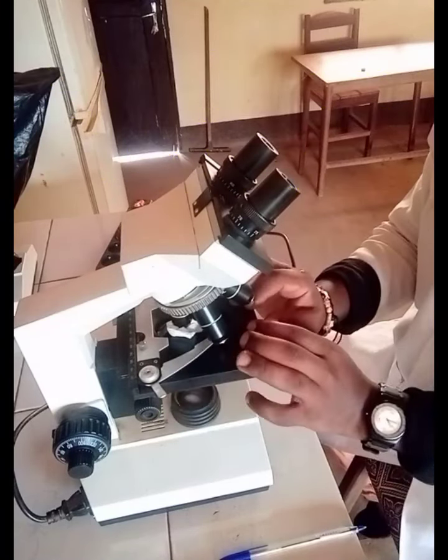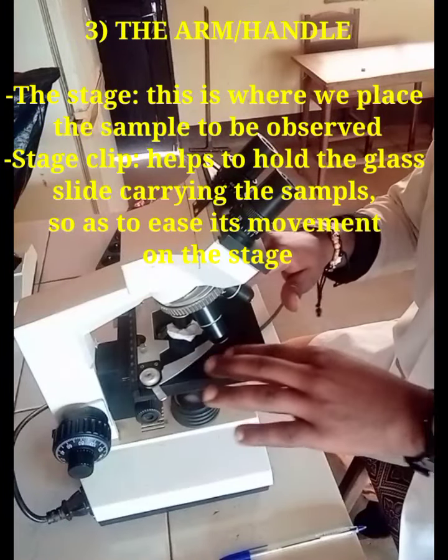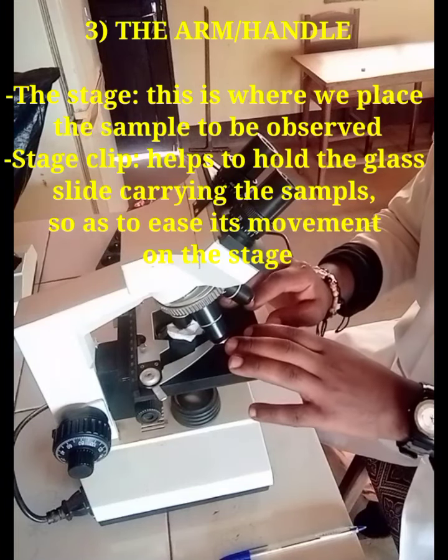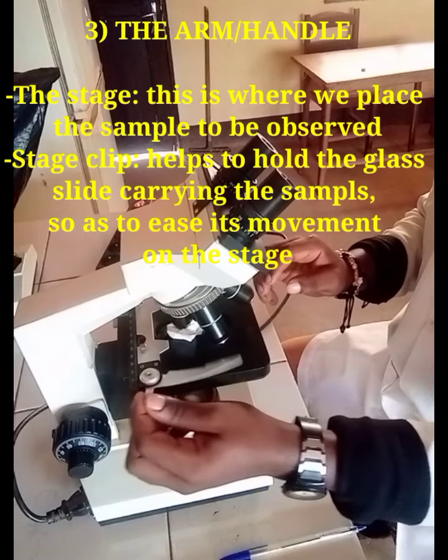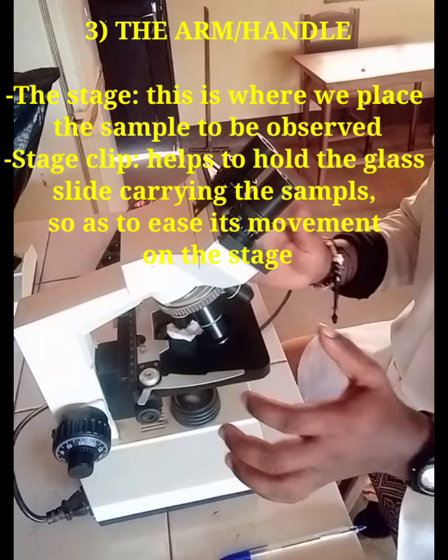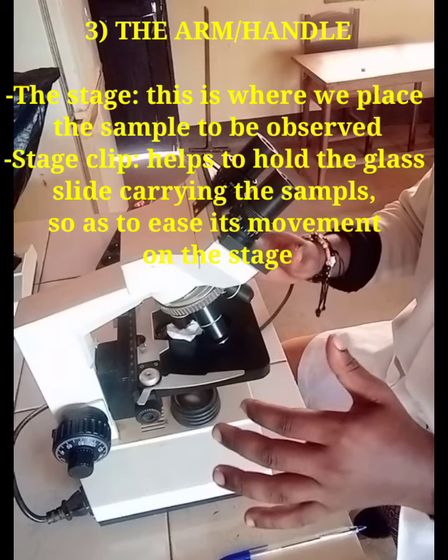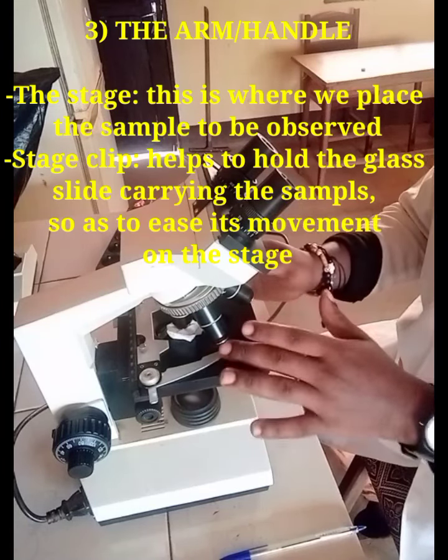Now, just below the objectives, we have the stage. Here is the stage of the microscope. And on this stage, we have the stage clip. Here is what we call the stage clip. On this stage, we place our slides. This stage clip helps us to clip the slides so that they are held firmly.